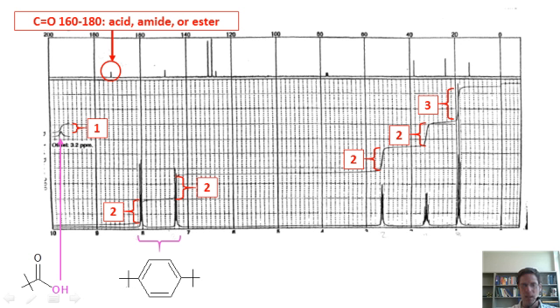So these two hydrogens here, assuming that the substituents coming off opposite sides of the benzene are different, then the hydrogens coming off of here and here would be equivalent, and they would integrate for 2. The hydrogens here and here would also be equivalent to each other, but they'd be different from the other two, and they would also integrate for 2. You see nice, neat 2 doublets appearing in aromatic land. That tells you, bam, it is a para-disubstituted benzene.